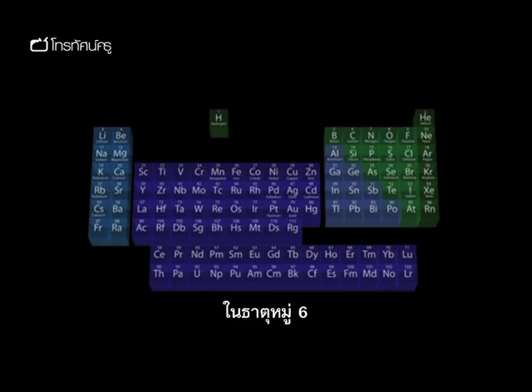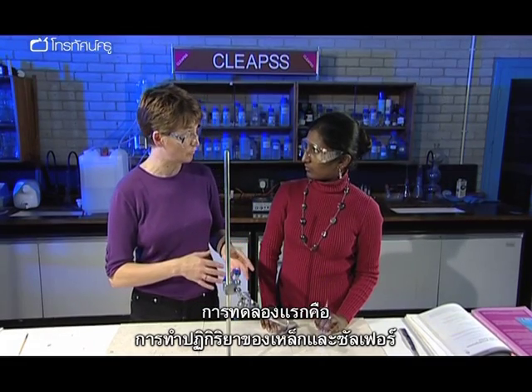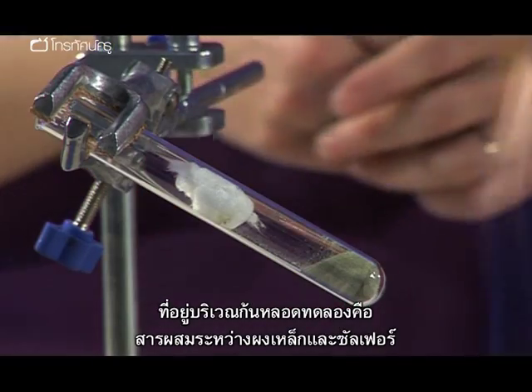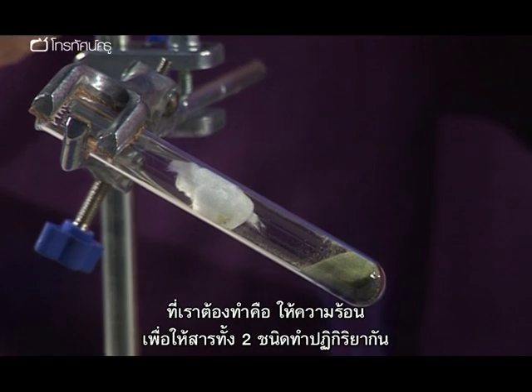In group 6, sulfur has many reactions which can easily be demonstrated. First one is reacting iron and sulfur. So what we've got in the bottom of the test tube is a mix of iron powder and sulfur, ratio of about 7 to 4. And all we have to do is heat it up and the two will react together.